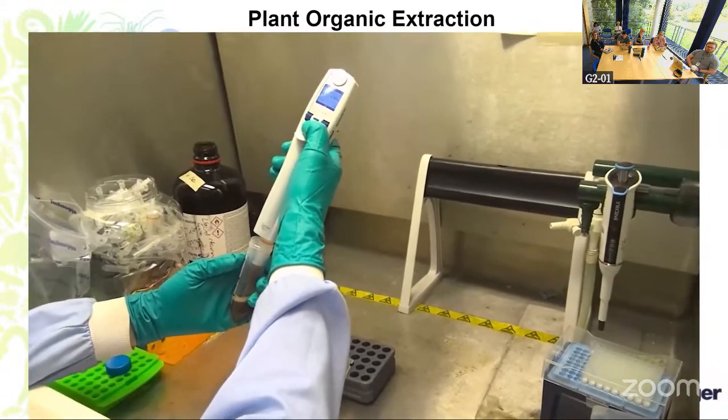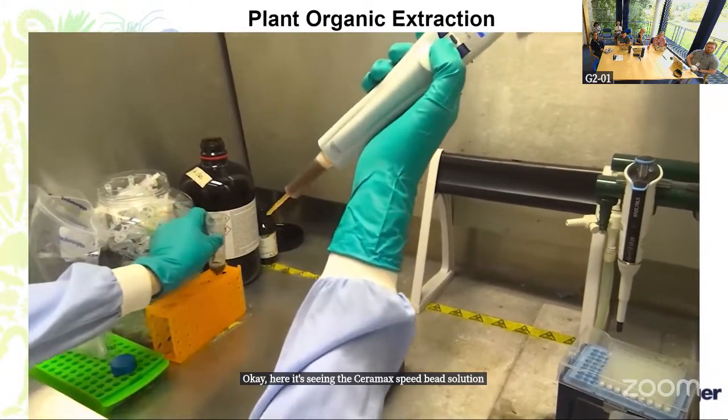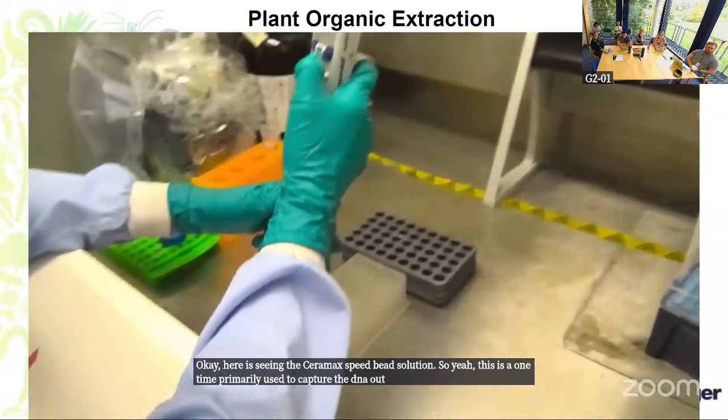Okay, here is the Ceramag SpeedBead solution. So yeah, this is used once, primarily to capture the DNA out of the aqueous phase and remove any residual contaminants.